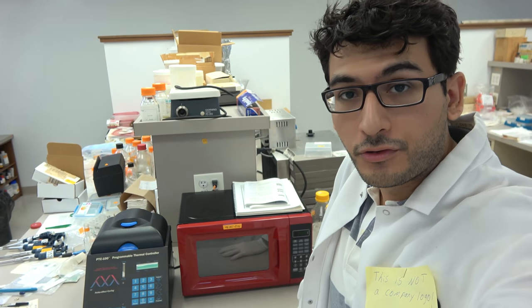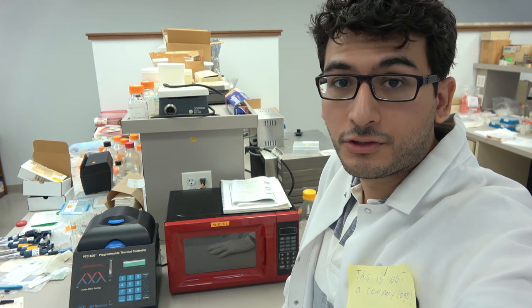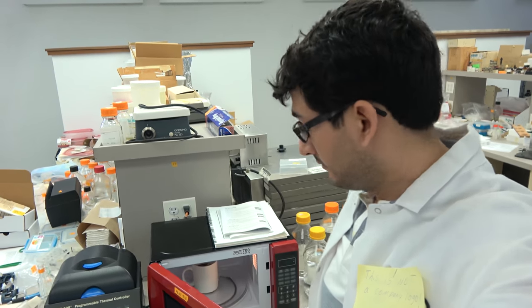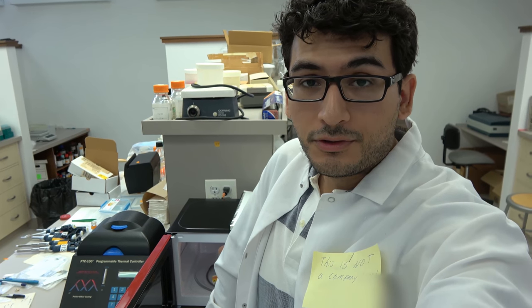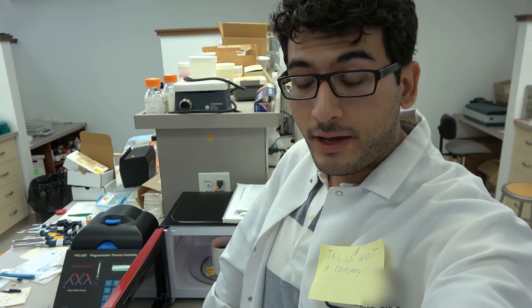Rule number five. Never put food or drink in the microwave. That's just gross. I can't use this now. I just wasted this for one joke. But in all seriousness, don't use the microwave in the lab to eat or drink anything. You have no idea what other people have been putting in here to get fucking cancer for all you know. That's the bottom line of all these rules. Think of it as this way. You don't want to get cancer.